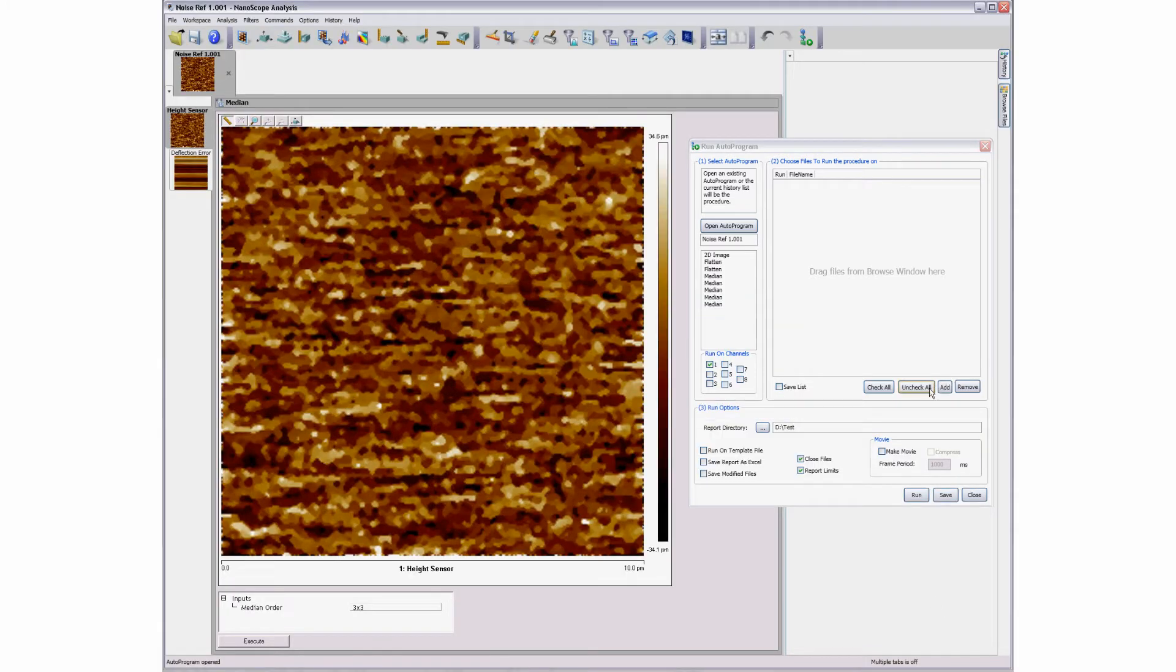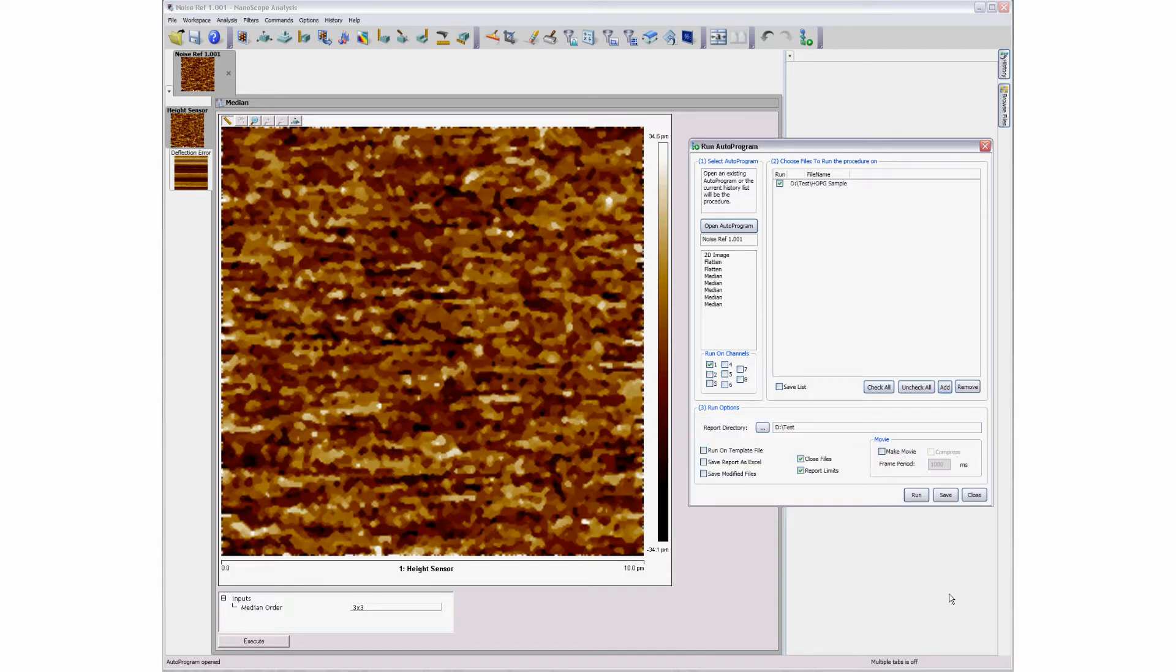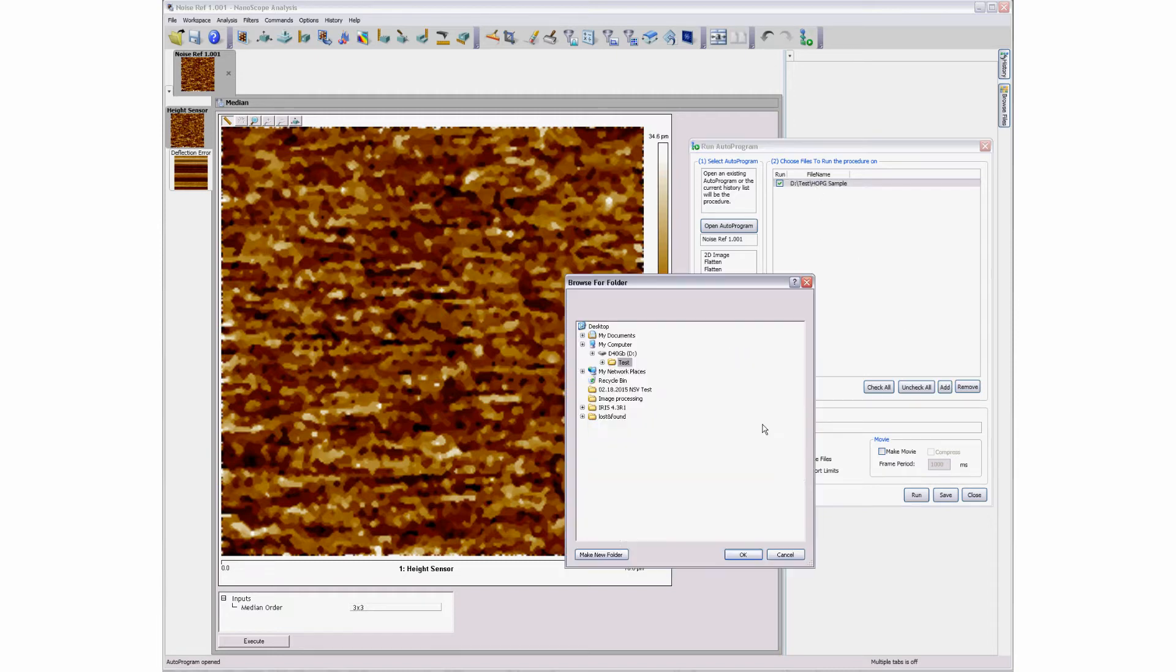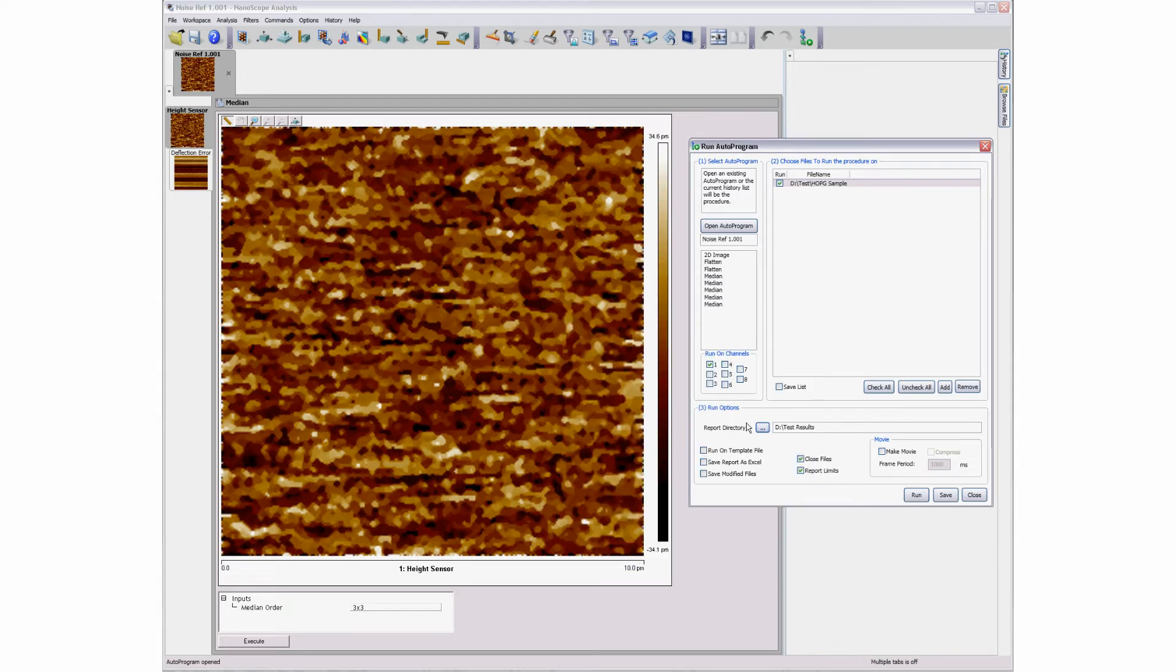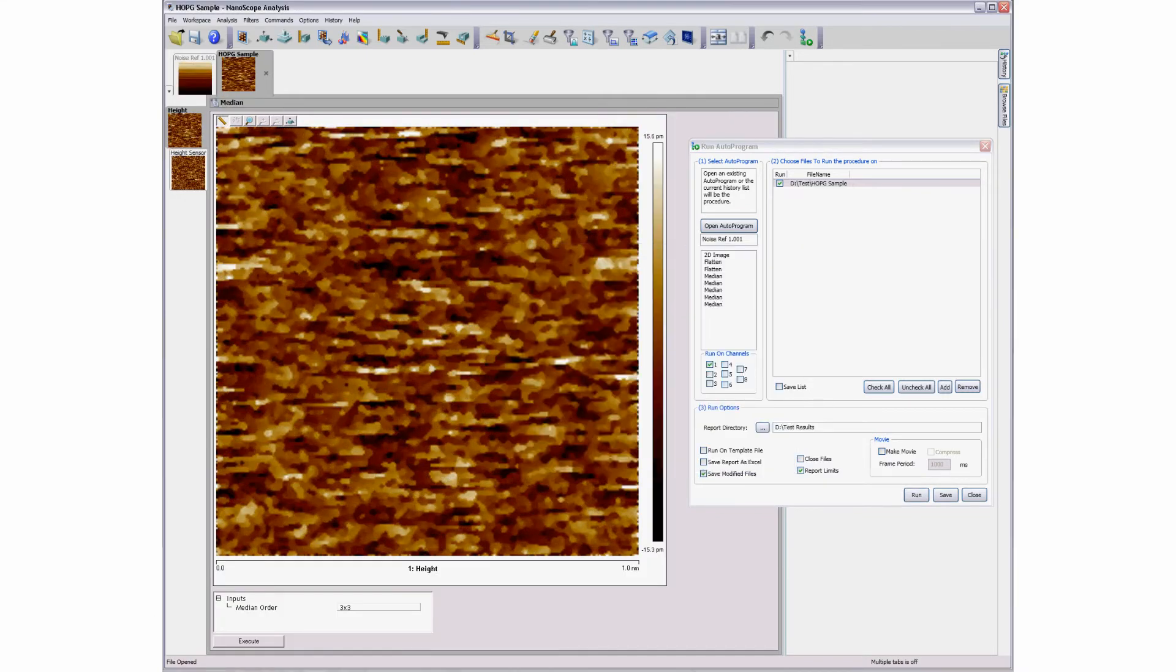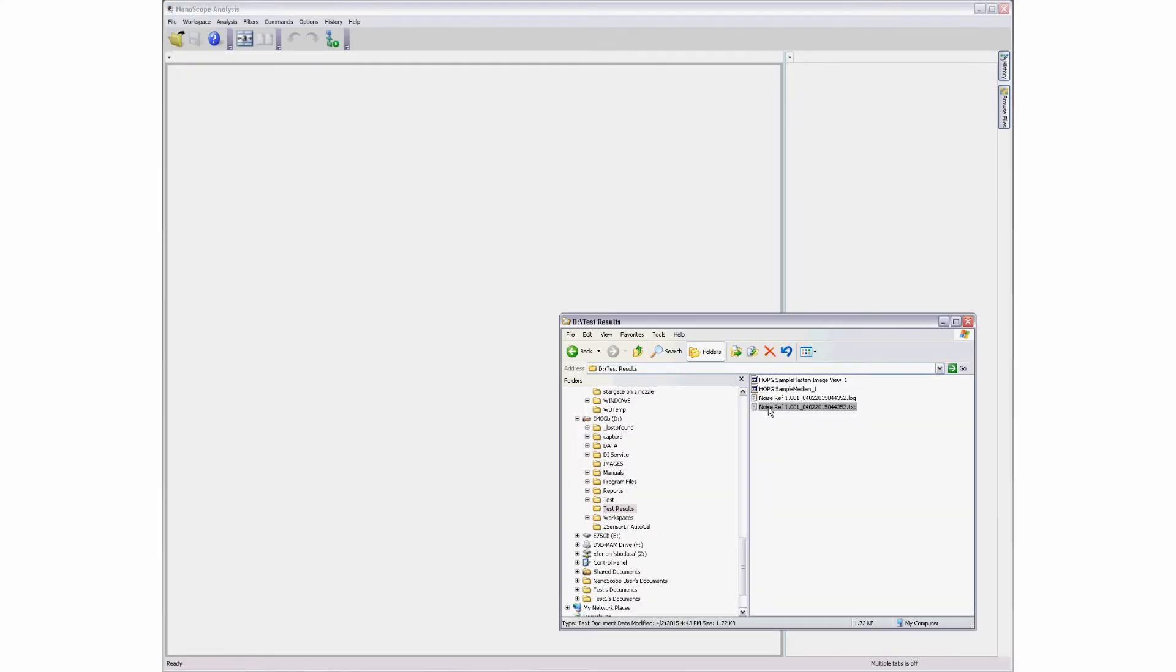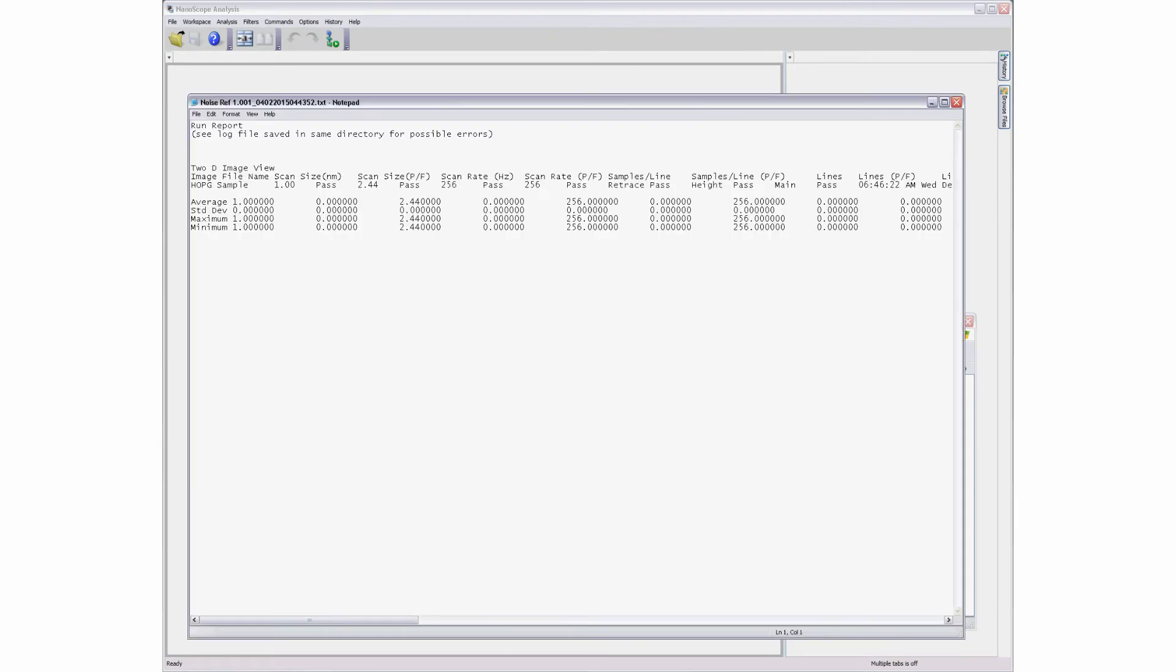Clicking the Add button allows the user to select a new file or set of files to be processed through the program sequence. Select a directory location for the results to be filed along with any desired reporting options. Then click the Run button to execute the operation sequence on the selected files. The resulting report files can be opened to view the tabulated calculations.